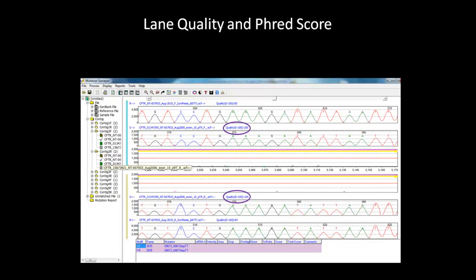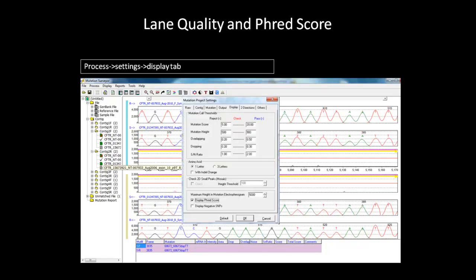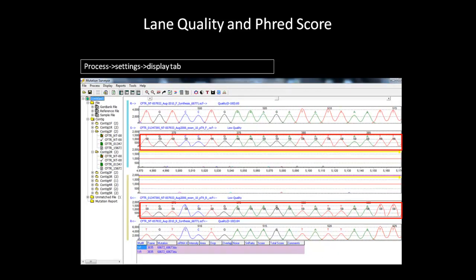In addition, mutation surveyor can display FRED score for each nucleotide if you want to use it as a quality metric for the data. To display FRED score, go to the process settings and select the Display tab. In the Display tab, check FRED score. After hitting OK, FRED score for each nucleotide are displayed in the main analysis window as shown here. The lane score and FRED score can be used to review the overall quality of each sample in the project.